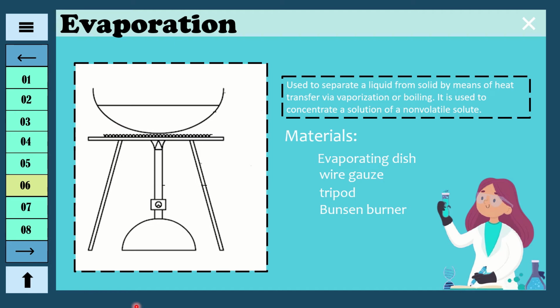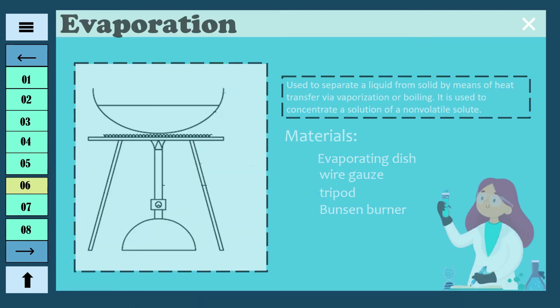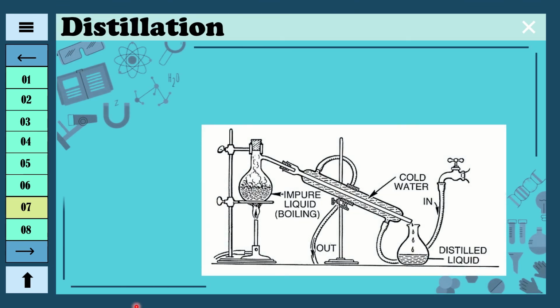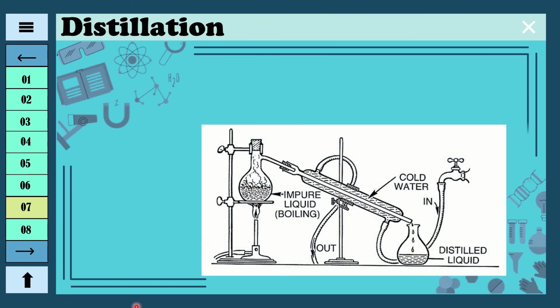We are now done with the techniques that separate mixtures of compounds. Let's proceed now to purification. The first technique in purification is distillation.